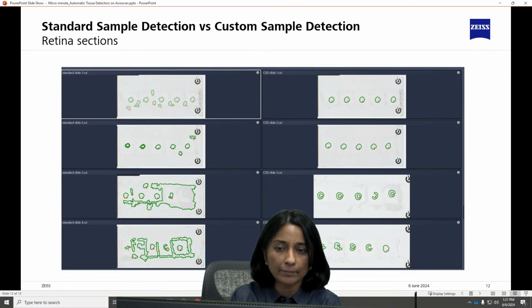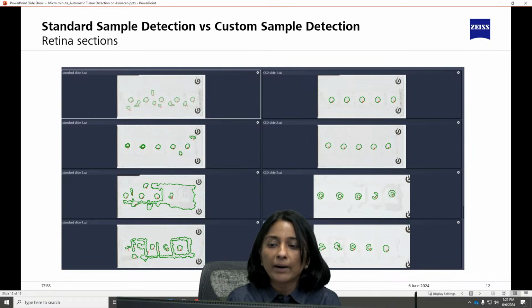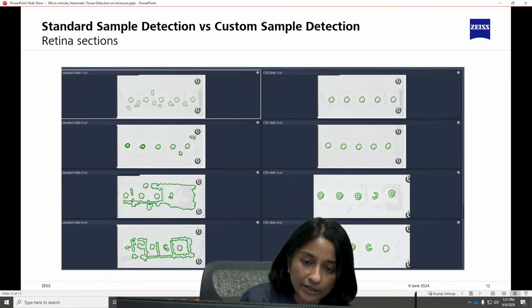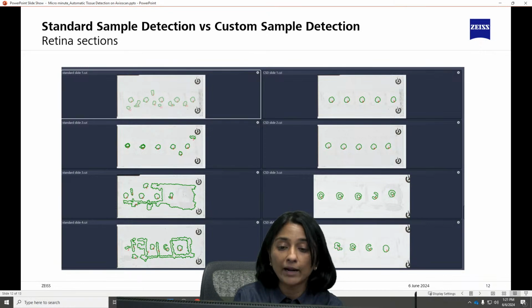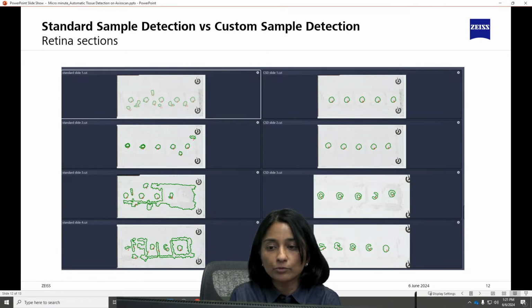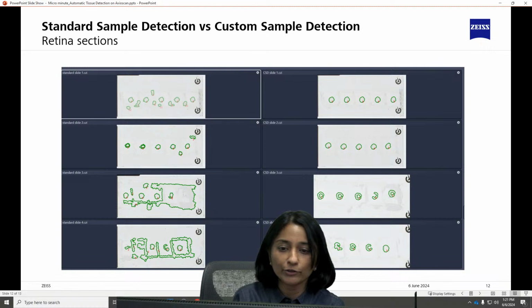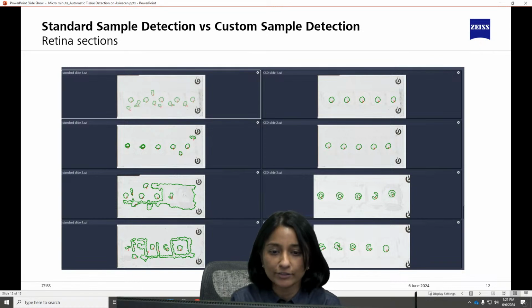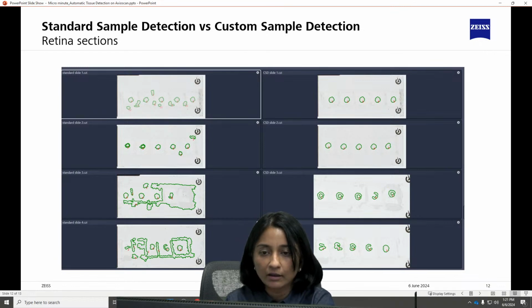We have utilized DAPI preview previously to detect these tissue scans. But now seeing the result with the AI models generated on the cloud platform, it appears to me that I personally would just transition over to utilizing just image analysis for detecting tissue sections.